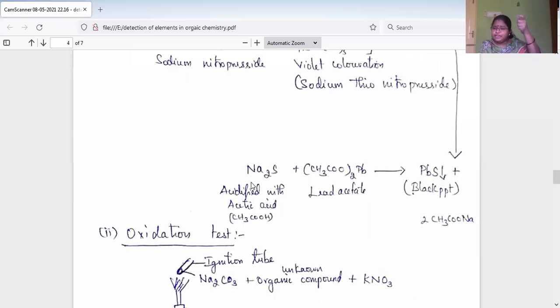Here, the second part. In the second test tube, second part, we are acidifying it with acetic acid. Usually, you might have seen in the test for sulfate, we acidify the barium sulfate with HCl if you use barium chloride, or with nitric acid when you use barium nitrate.